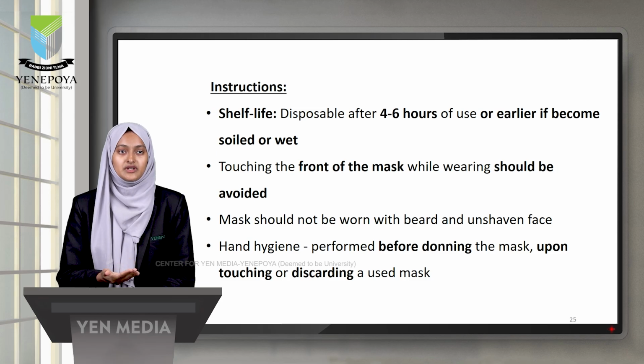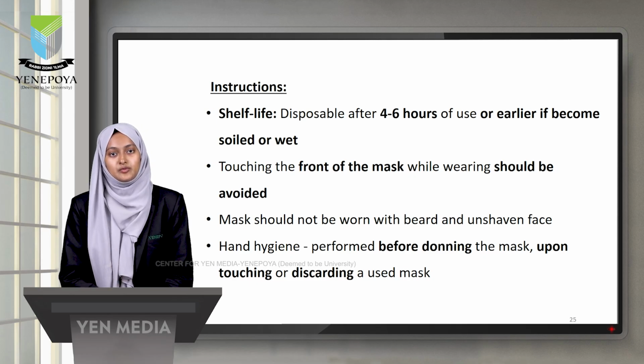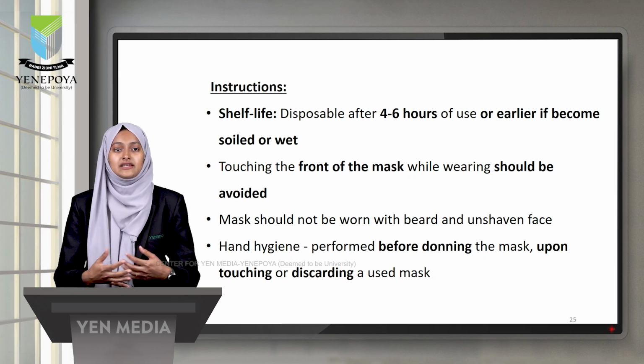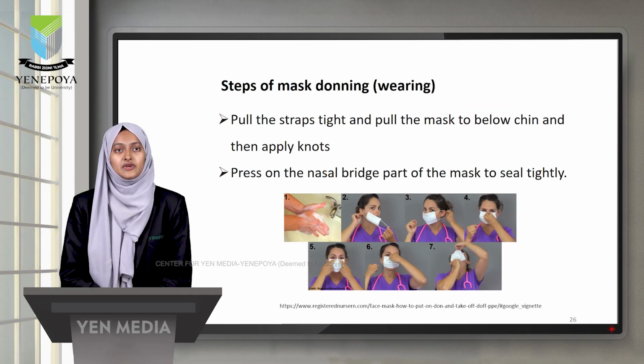Once you've worn the mask, you should avoid touching the front of the mask, as that area will be contaminated. A mask should not be worn with a beard or unshaven face, because it can create gaps, and hence the protection will be much lesser. Hand hygiene has to be performed before wearing the mask, as well as before touching and doffing the mask.